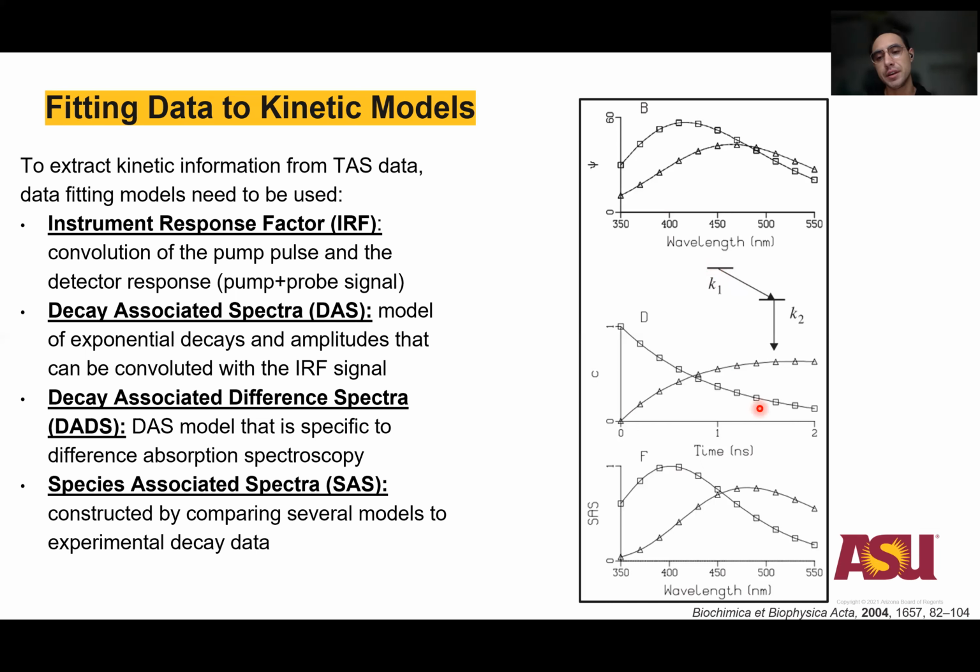And so this is going to be the time domain at different pulse lengths, and then you're going to be able to fit your data to some sort of model that looks something like this.